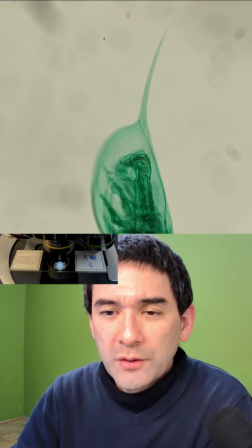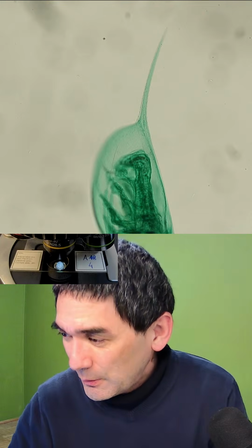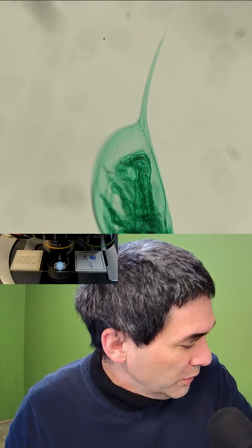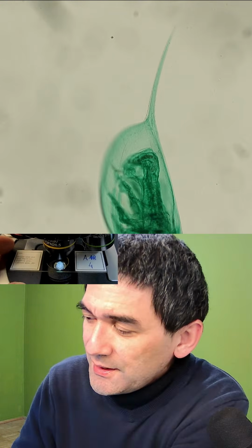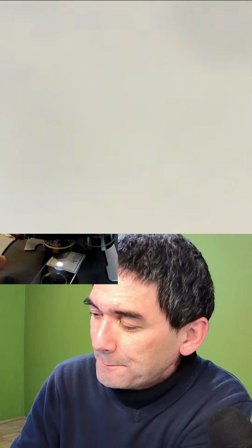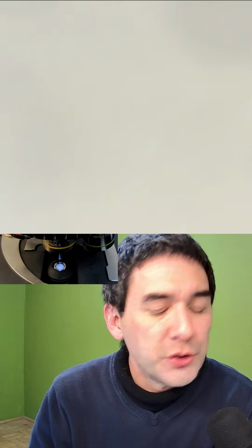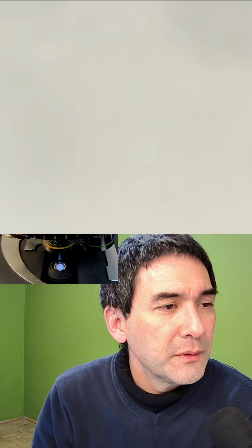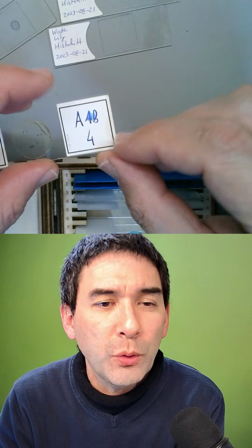I wonder what you wrote on the right part of the slide. I did not write anything, but I will show you because you wanted to know. This is a commercial slide. So you were wondering about this here, A184.